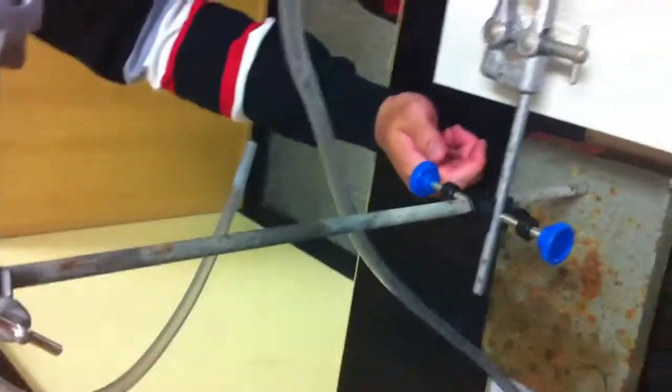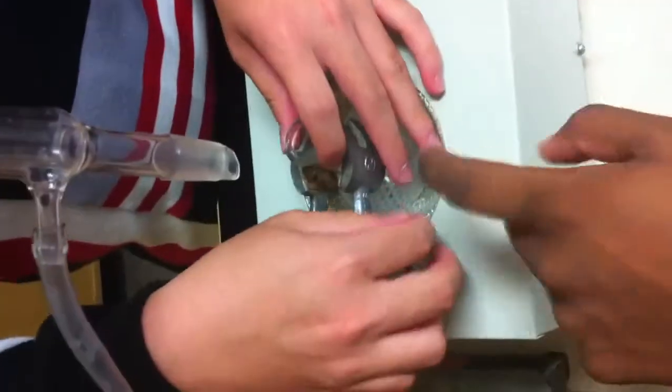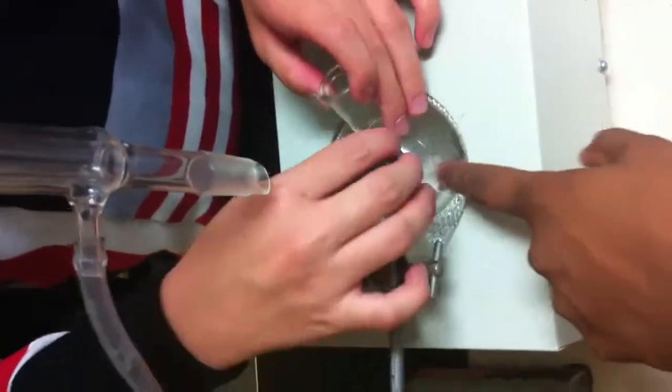And then this is a retort stand. It's hooked up to hold some kind of glassware. And then the rest of it's hooked up to this.